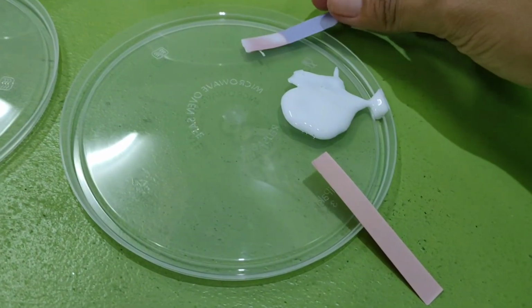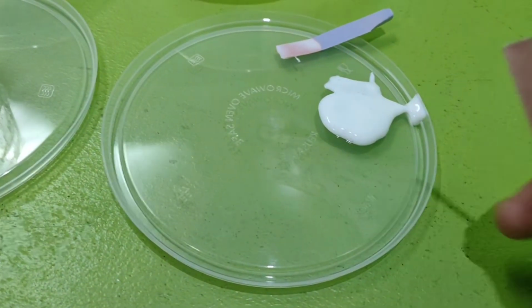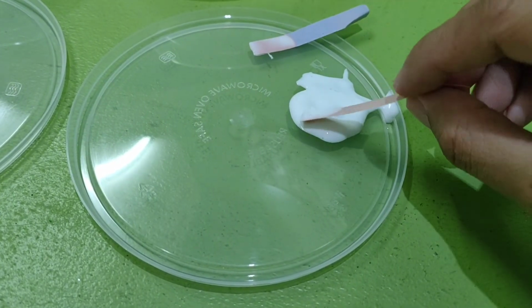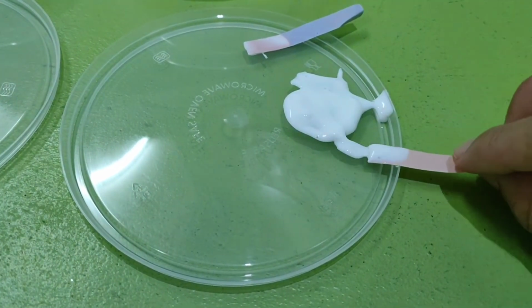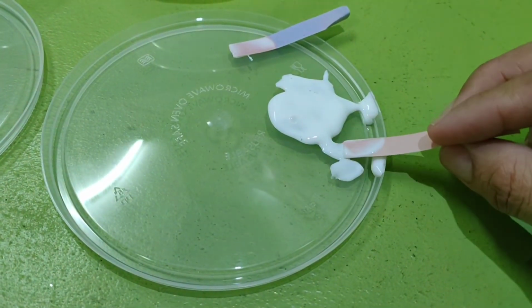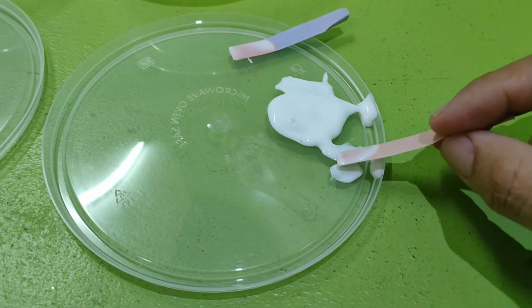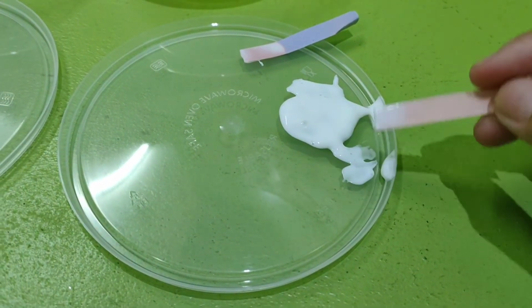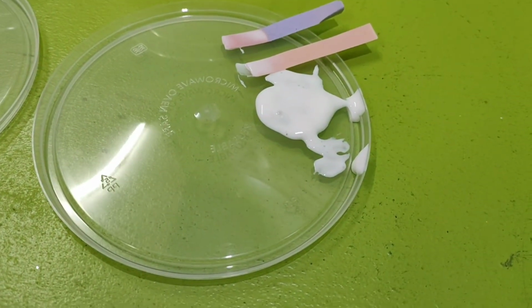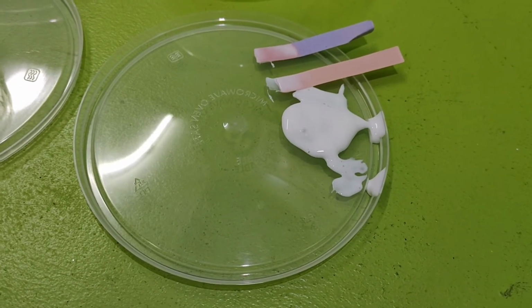So alam nyo na kung ano yun, di ba? Okay, si red litmus paper naman kaya, let us try. Okay, so sa nakikita nyo, walang pagbagong kulay. So, still the same red siya. So ibig sabihin, Elmer's glue is an example of what we call an acid.